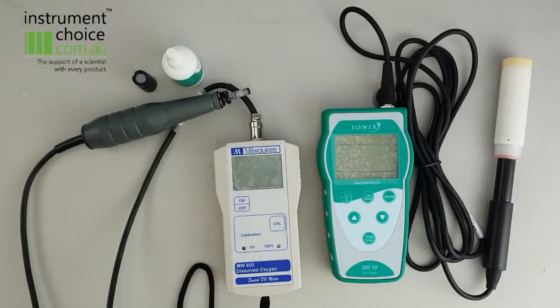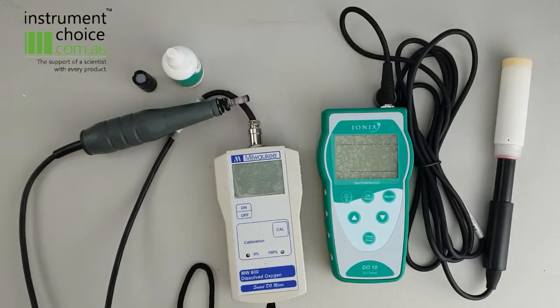Good morning guys. Today we're going to take a look over the DO10 by Ionix and the MW600 by Milwaukee.